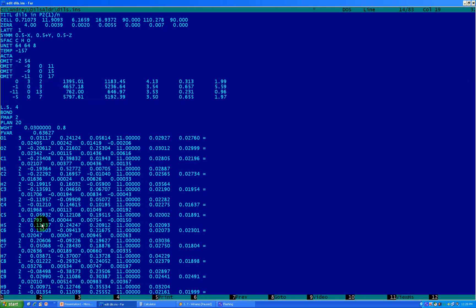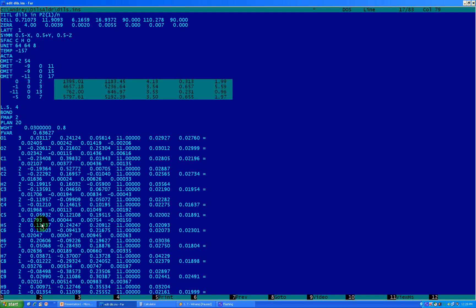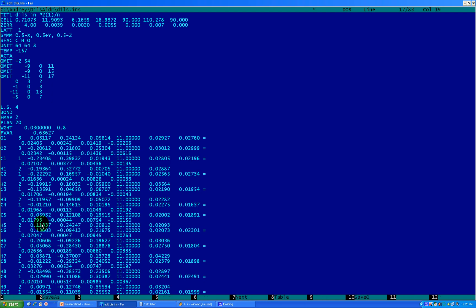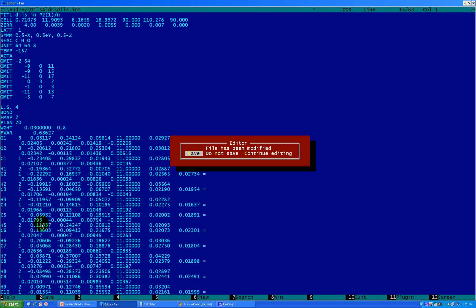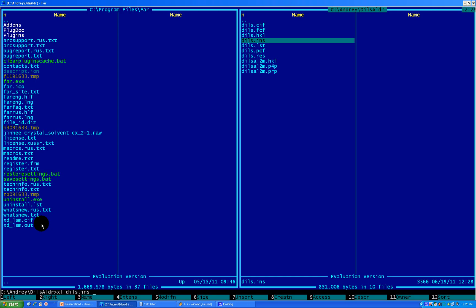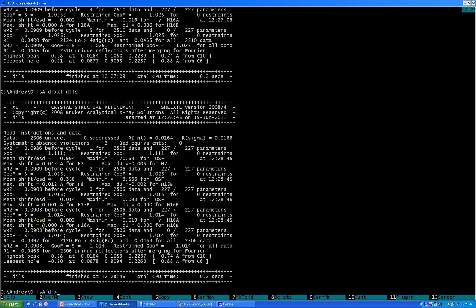Go to the top line of the values. Go Alt-Arrow down all the time, keeping Alt pressed. Then go to the right and select those values. Delete them with Shift-Delete. Sometimes I also like to do it with Alt — select those things, Ctrl-C, and Ctrl-V here. It saves you time. Alt-Arrow down to deselect. Escape. Run SHELX again. It doesn't really help much — a little bit decreased our GOOF, a little bit decreased our R-w2, made our R-1 below 4%. So it's good.